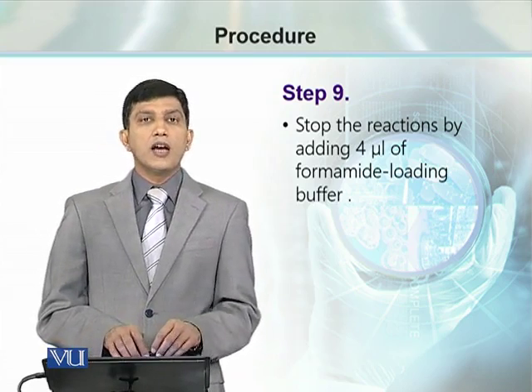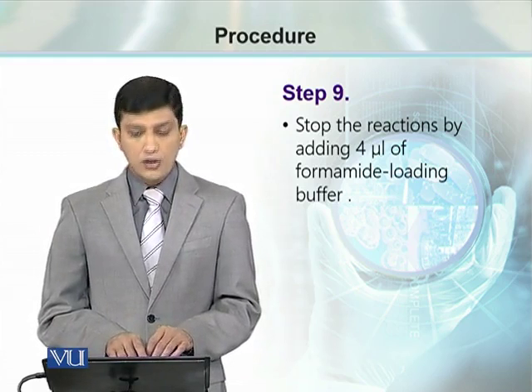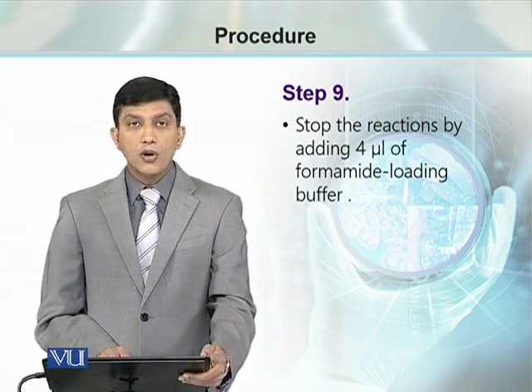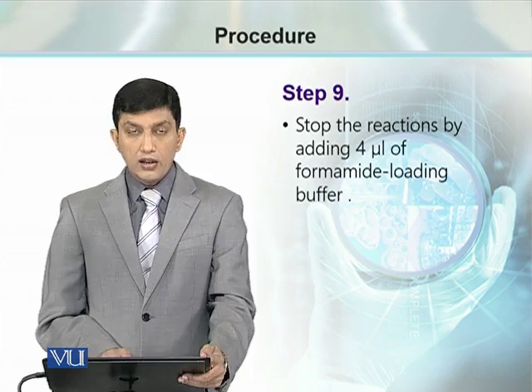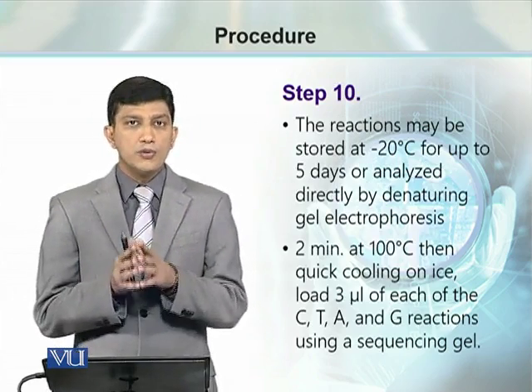After that, we are going to stop the reactions by adding 4 microliter of formamide-loading buffer, and that is the last step for this particular procedure.